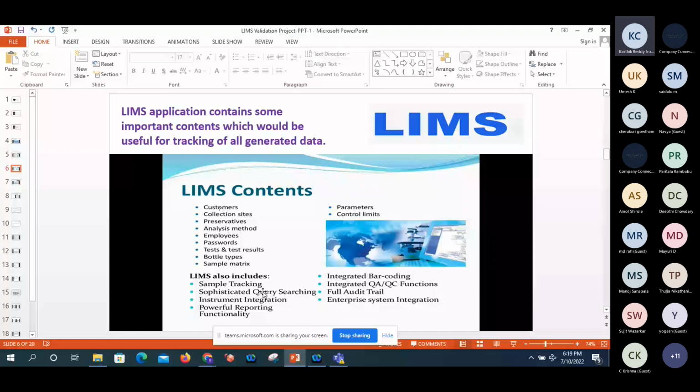Why? Because there are subroutines, some SQL writing, global context, global text, all of which need to be written. After that, there are so many balances, like in a quality control laboratory, and each balance needs a separate parsing script.